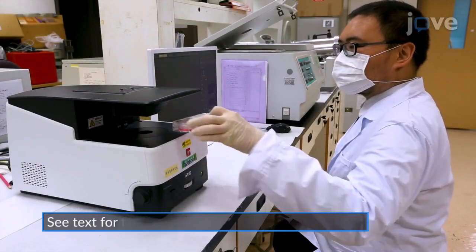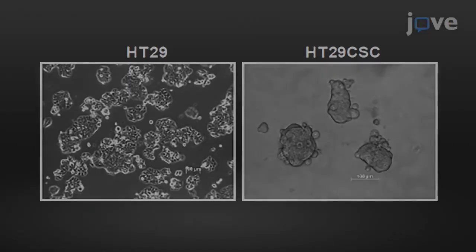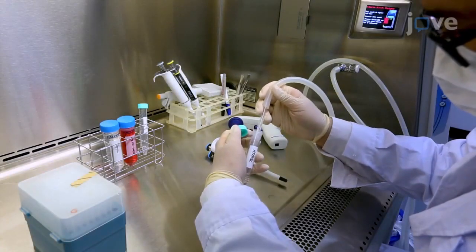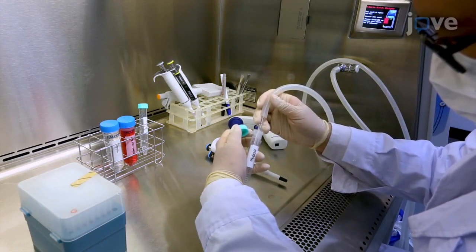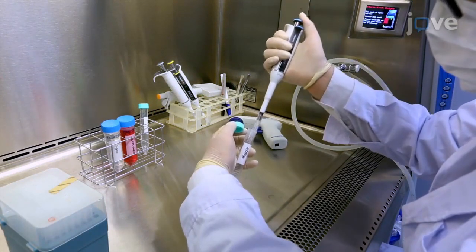On day 7 of culture, use an inverted microscope with a digital cell imaging system to observe and measure the diameter of the tumor spheres. When the tumor spheres reach a greater than 100 micrometer diameter, treat the culture with 0.25% trypsin.